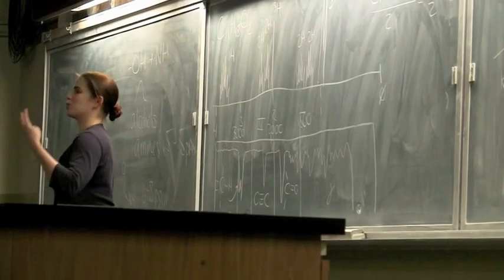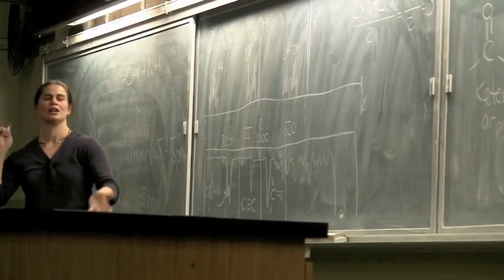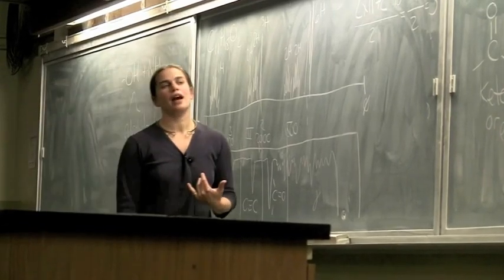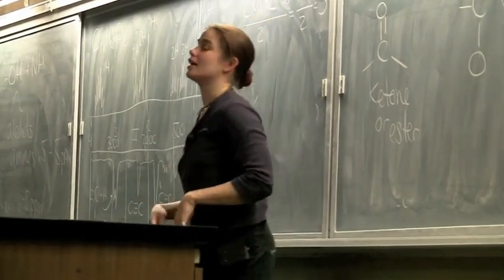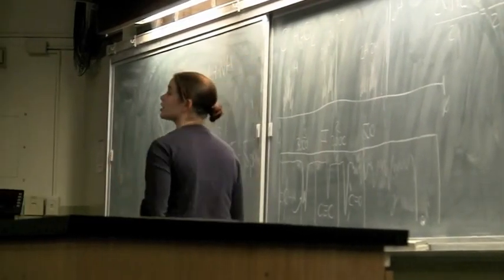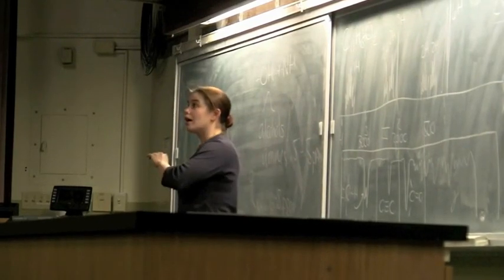Which ones are real, which ones are imaginary, which ones have already been placed? Get confusing again. So I don't write down personally any atoms until I know exactly where they are. I know which peak they are on that spectrum, and then I can write down the atoms. But I do want to write down that information that I know there's 6 hydrogens nearby.